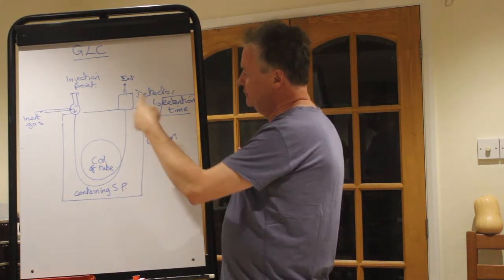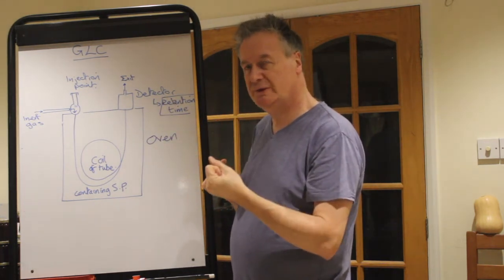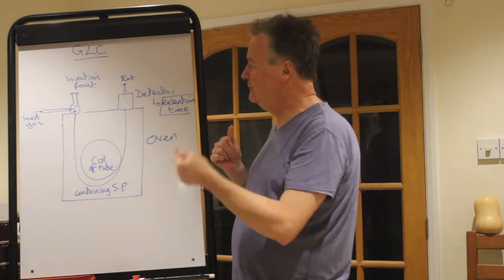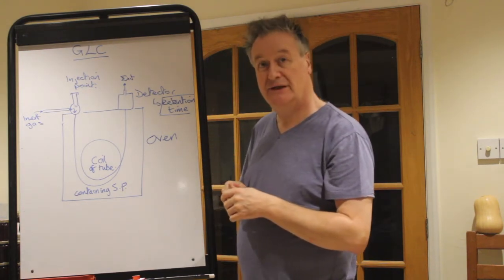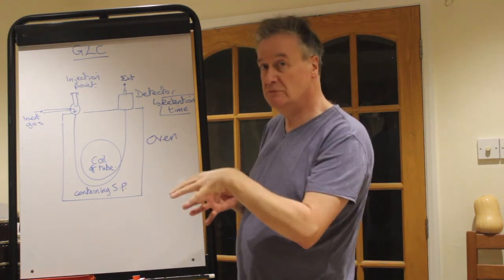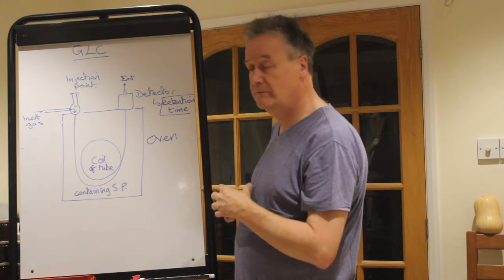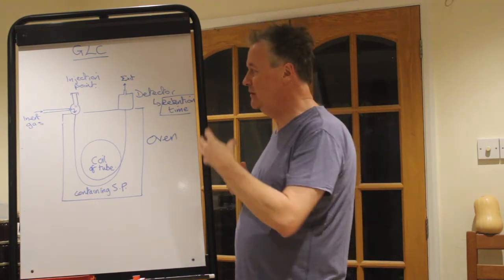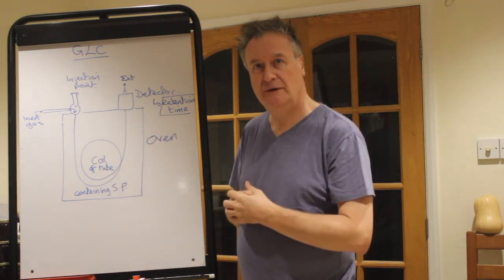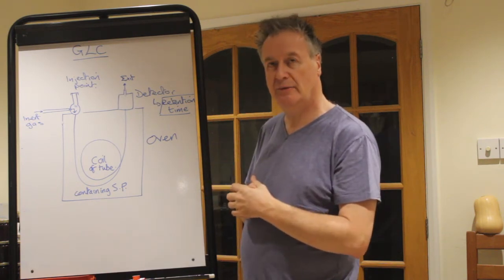So they go through here, things that interact strongly with the inert gas but not with the oil come out quickly with a short retention time. Things that interact more with the oil and therefore less with the inert gas have a longer retention time because they get caught up on the stationary phase and don't move so fast, maybe 15 minutes rather than 2 or 3 minutes. And that's how you achieve the separation, by them being retained for different amounts of time within the coil that is the key part, with the two phases within the coil, stationary and mobile.